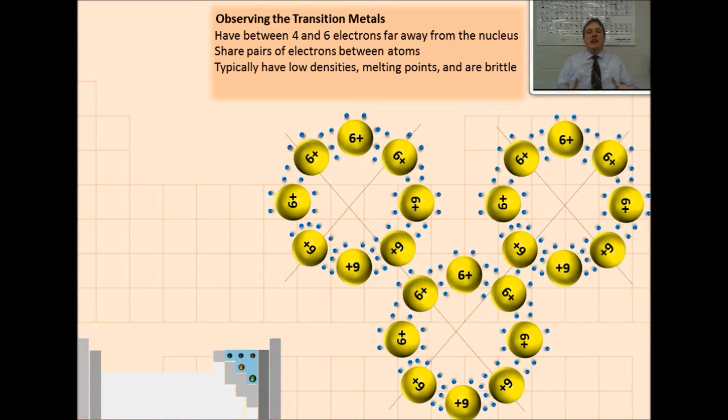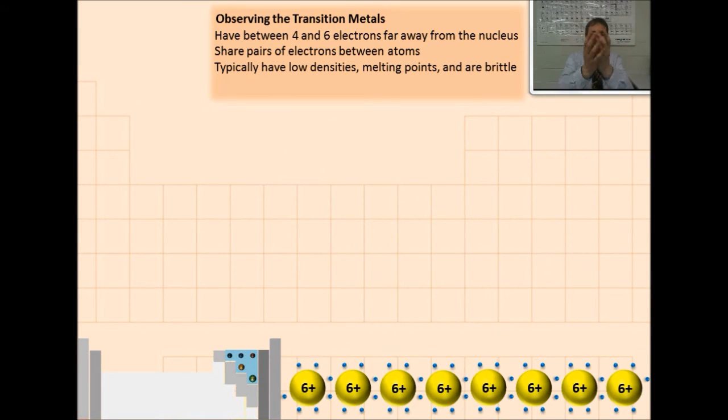And then as you let it cool down, take it off the flame, instead of cooling it down slowly and letting those rings reform, you cool it down very quickly by pouring it into cold water. And those rings do not have time to reform. Instead, what happens is the rings stay spread out in these long lines called polymers.